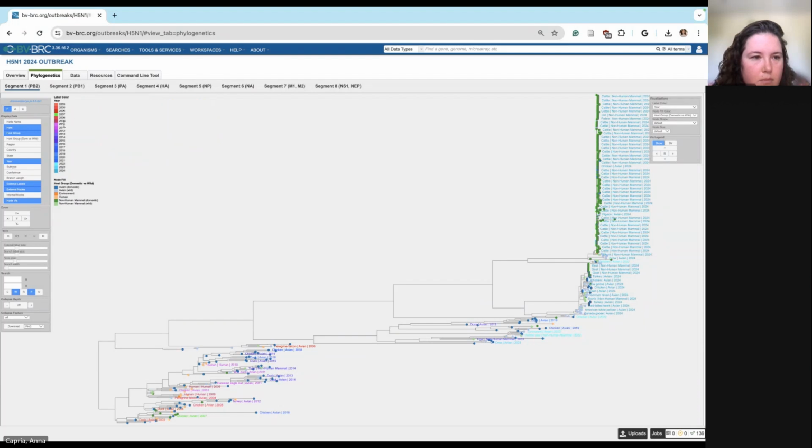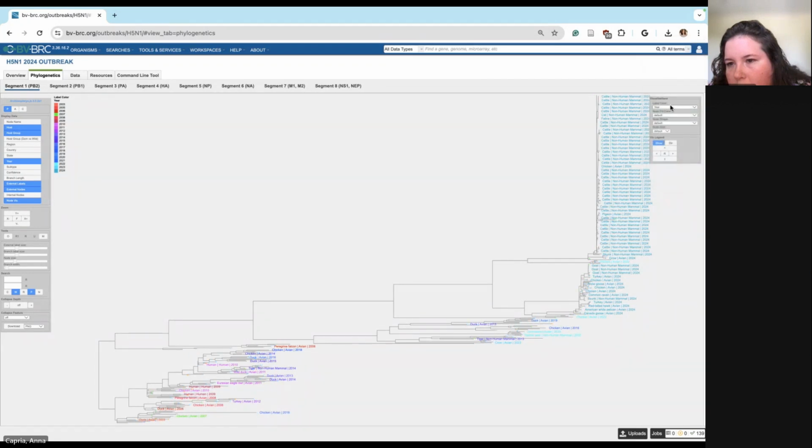And then maybe you could put all the visuals on the right side to default. How do I do that? You have to go to the menu on the right side, and there you just select default for all of them.